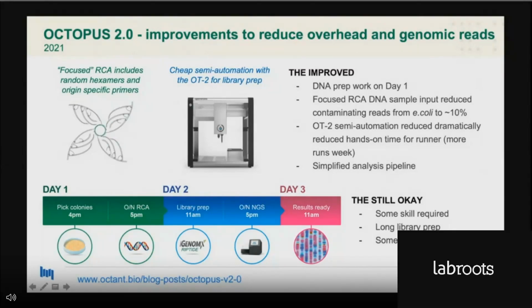But while we addressed the gDNA and hands-on labor problems with the V2 update, the library prep process itself, while still using the library kit that we had, still had a lot of moving parts that made the process more complicated than we would have liked.